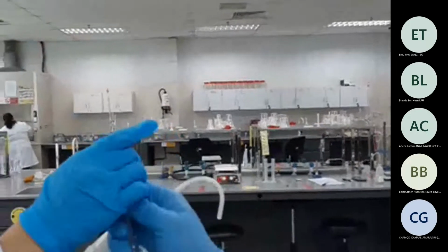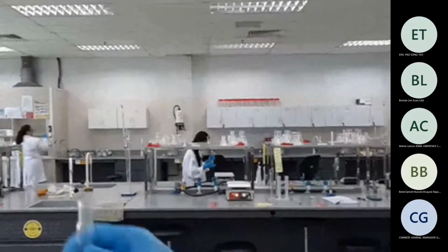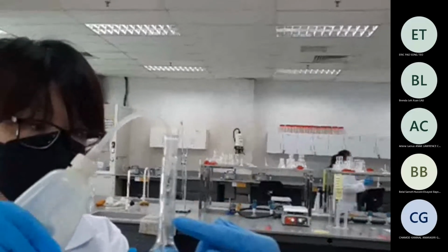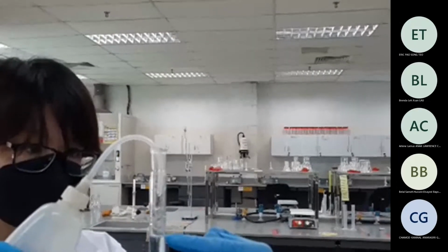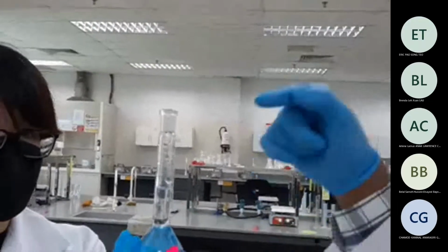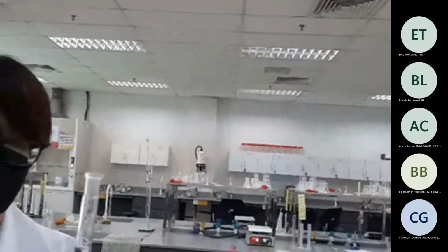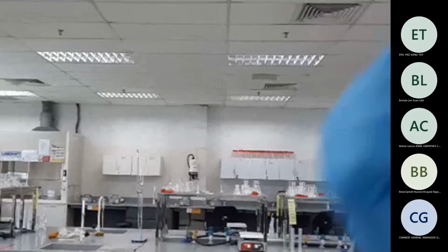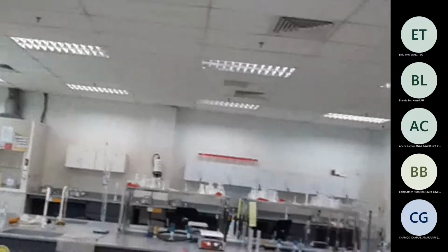Is it too hard? Twist it like a cap, yeah. And then hold it. And then add the water until this part. Don't make it full. More, a bit more. Okay. Now take a dropper and then drop by drop add the water. Take a dropper from there. Or you can also use the pipette, but pipette you need to wash it, so take a dropper better.